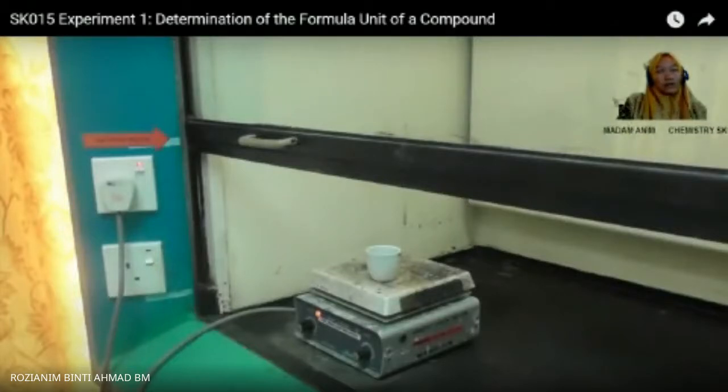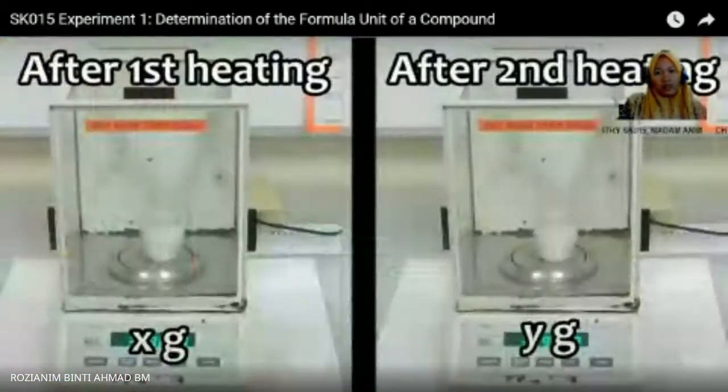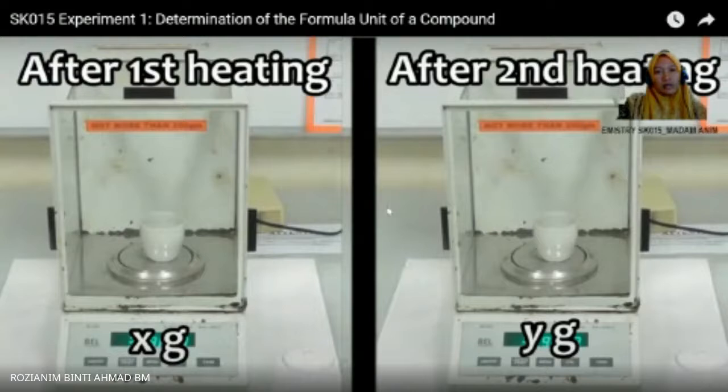Okay, so yang dikata tadi, procedure number 8. Okay, ramai yang tertinggal dekat situ. Dia berlaku reheat. Okay, so what happened? So this heating occurs not just 2 times, maybe 3, 4 and so on. Target kita adalah our substance should be totally dry.